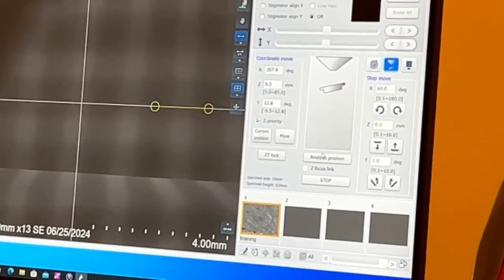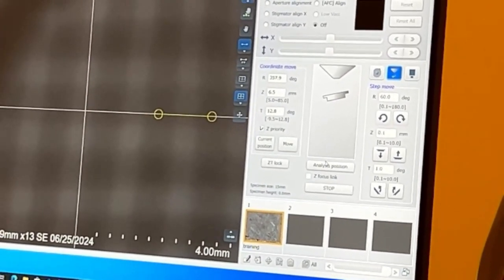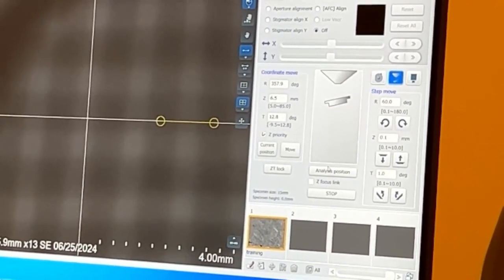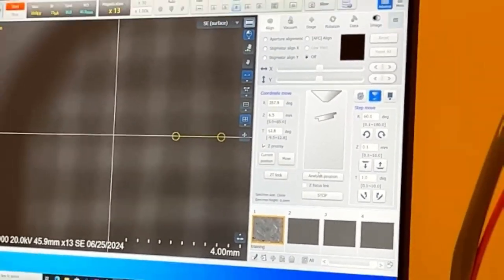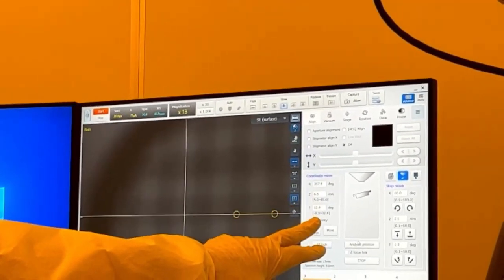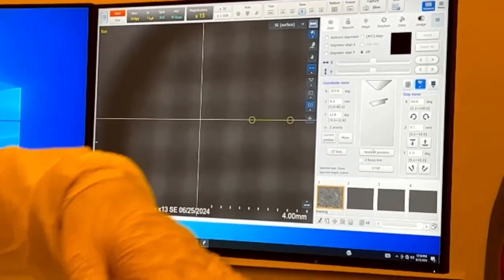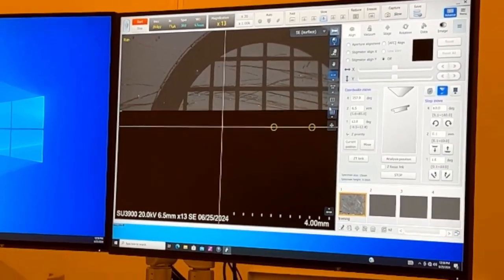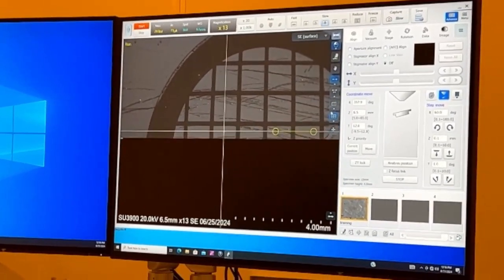But does it have any internal sensors to not have it pump? The camera? No, it's not the camera, but the sensors. Yeah, the sensors. When we loaded our sample, we set those parameters so that we weren't going to hit anything. The question is, we cannot move it below that.